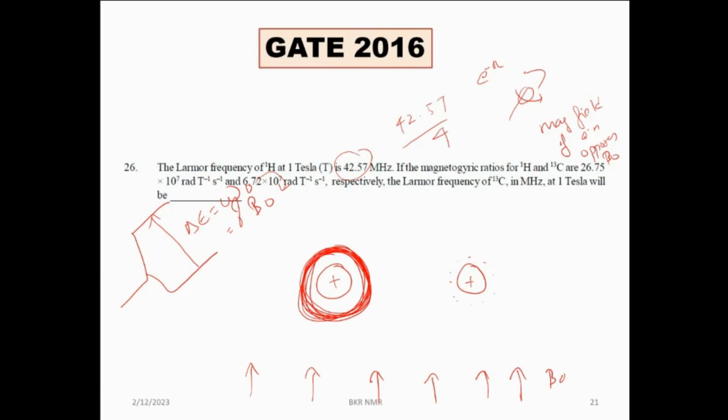Will this nuclei receive the music? Receive ஆகுமா ஆகாதா? இங்க ஆகாது, இங்க ஆகும். So this nuclei will not receive the music. So இது டான்ஸ் ஆடாது. ஆனா this will precess, பயங்கரமா precess with very fast speed because it is listening to the music. மியூசிக் அப்படியே காதுக்குள்ள போகுது. இங்க மியூசிக் காதுக்குள்ள போகல. ஏன் போகல? என்னை காதுல அடைச்சிட்டாங்க.